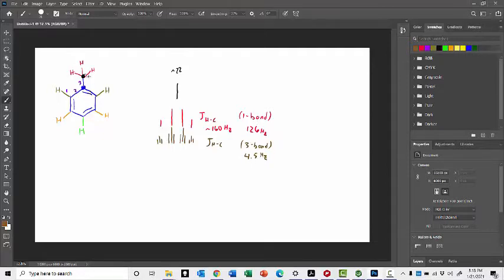And so what we're seeing here now is that the black carbon stops being a single line and becomes a quartet because of the action of the 3 hydrogens that are directly bound to it. But then each and every single one of those lines becomes a triplet because of the action of a hydrogen that is actually 3 bonds away from that carbon. Being directly bound has a very large J value, and there's a large influence from the hydrogens that are directly bound, single bond away, and there's a much smaller influence for the 3 bond couplings.